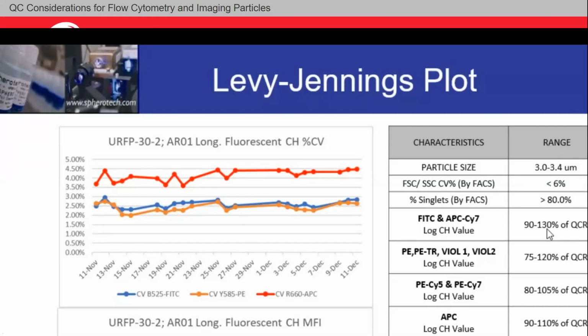Thank goodness now we have these fiducial tools. Thank goodness we now have polystyrene particles that we can internally encapsulate with dyes that are extremely regular, where you can dope them repeatedly and control the amount to which you're doping them. You can get them so that you know your lab maybe in Texas is running the exact same thing that you're running in California, or your lab in New York is running the same thing that you're running in the UK or across the world. This is one of the powers of having a specific lot and having polystyrene latex particles that are internally encapsulated with these organic soluble dyes. But there is lot-to-lot variation. On the same beads, between days, no.